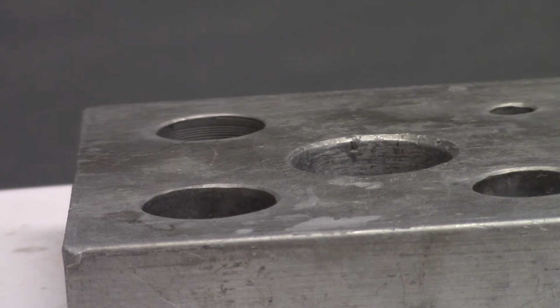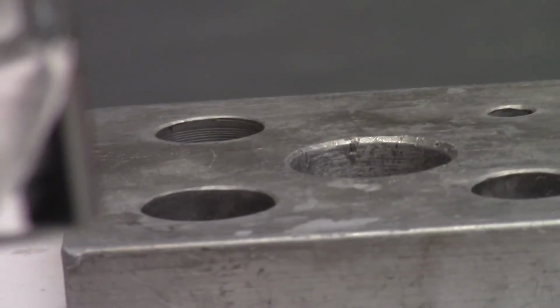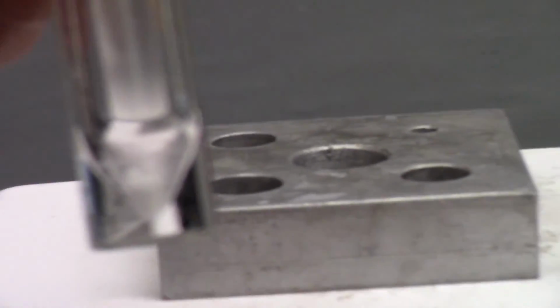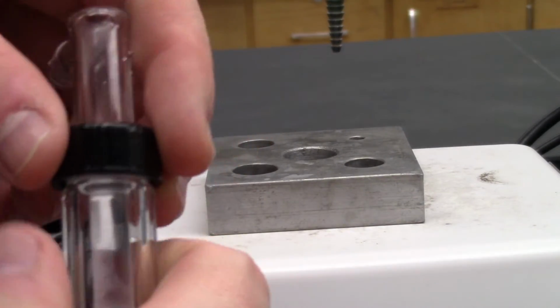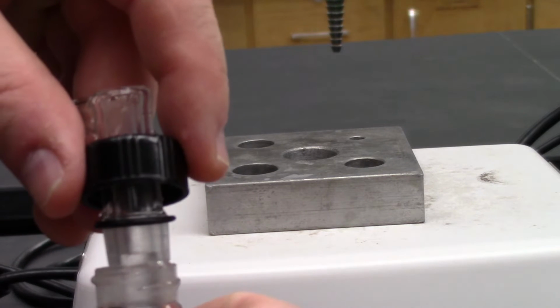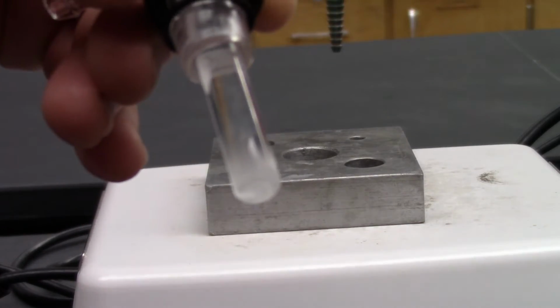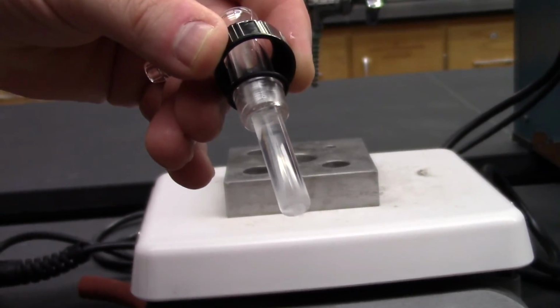There we go. Now, the next trick is to get this off without knocking any of the crystals off the cold finger. Let me back up a little bit, guys. Oops, that was the wrong direction. There we go. Now, it doesn't look like much, but there's plenty enough there for a melting point, guys.